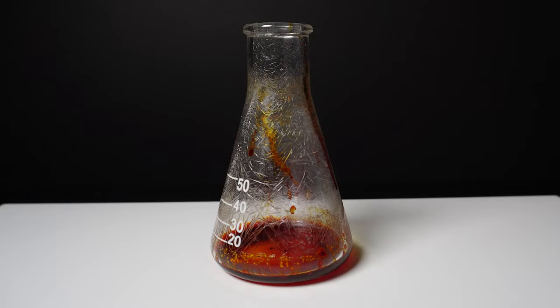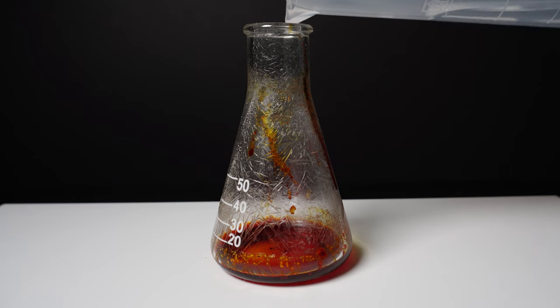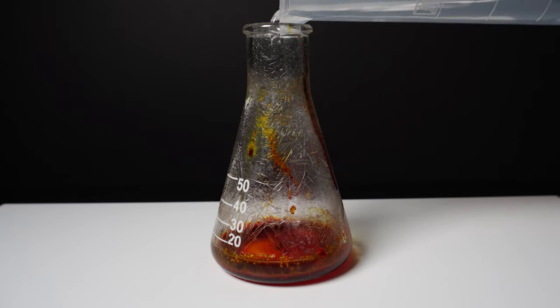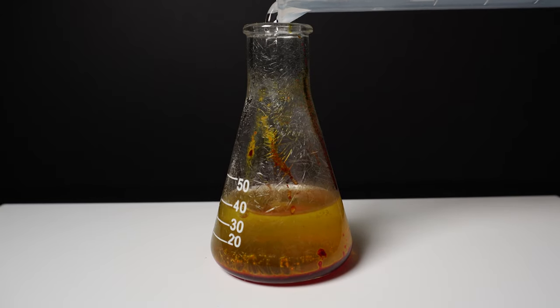Our next step will be to dissolve the fluorescein, and we start by adding water. Fluorescein is not too soluble in water, so only a small amount dissolves, which is the yellowish color that we see.